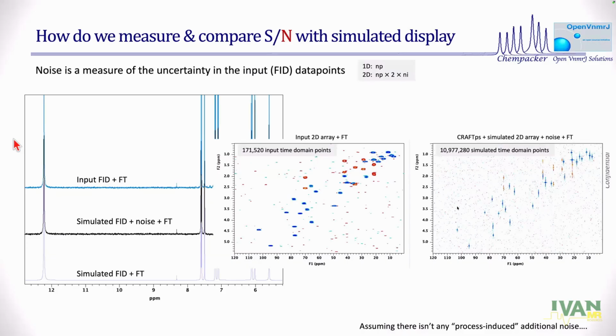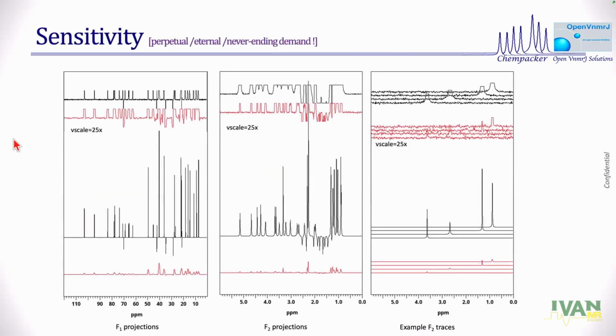And that's the same thing. Now I can compare these two, with random noise being constant, an oxymoronic statement. Here is the spectrum. That's a projection of the FT result, and the projection of the pure shift results that has noise in there. We added that noise.